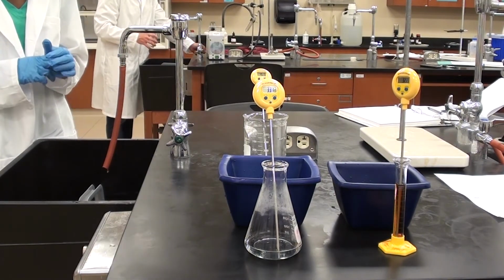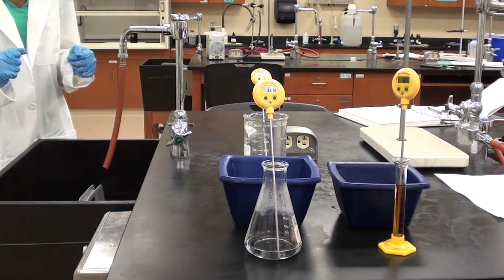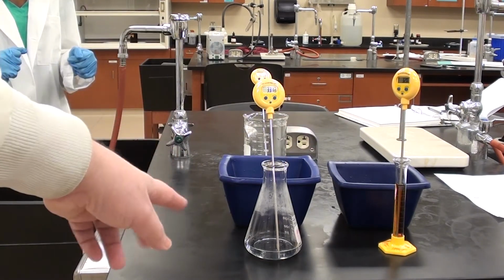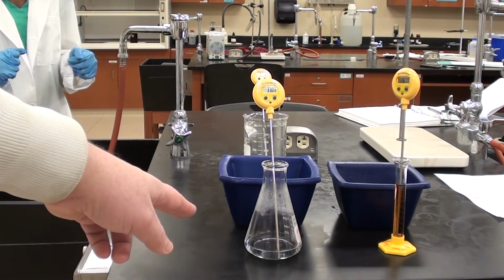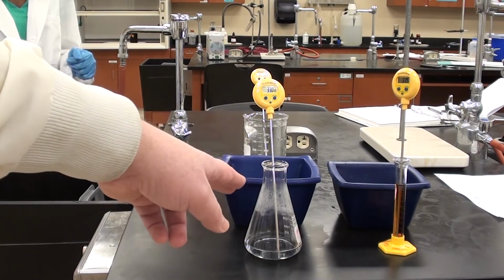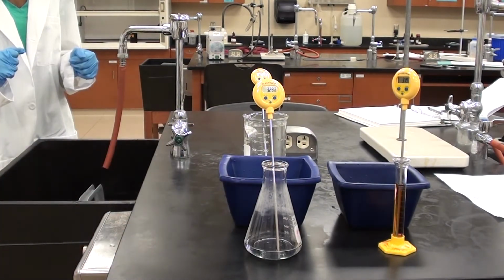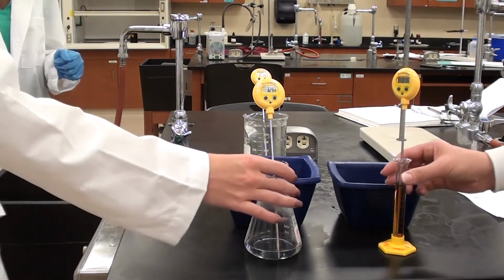So this is the part where we're going to get the solution to around 40 degrees. And what we need to do is have these solutions separate. You can see they have separate thermometers in each of them. This is going to be 10 mils of HCl, 10 mils of acetone solution, and 20 mils of water. And there's the 10 mils of iodine in there. Would you please go ahead and put them both into their respective containers?